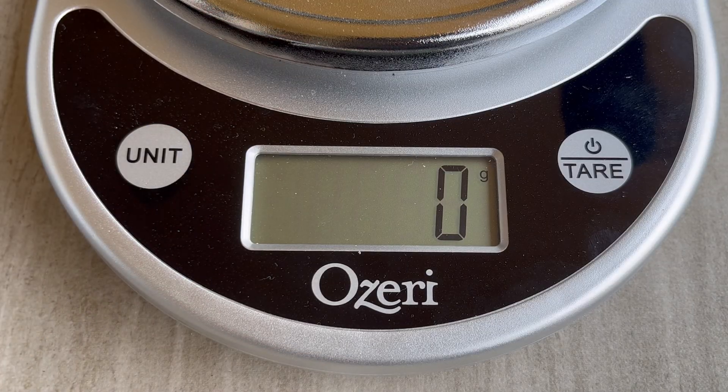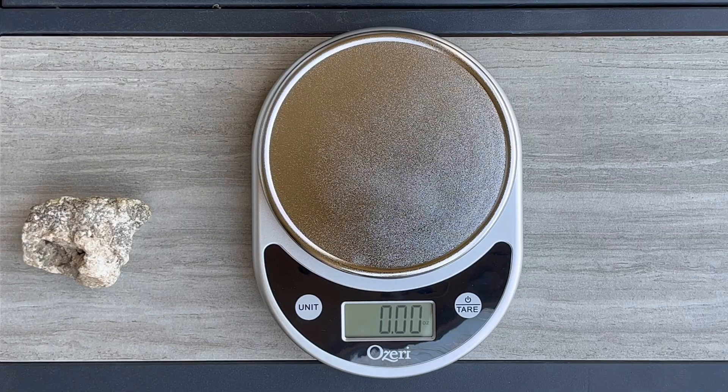If you're measuring weight, you'll use ounces, pounds, or pounds and ounces. If you're measuring mass, you'll use kilograms or grams. As for all those other units — if you don't know what they are, just don't worry about them.